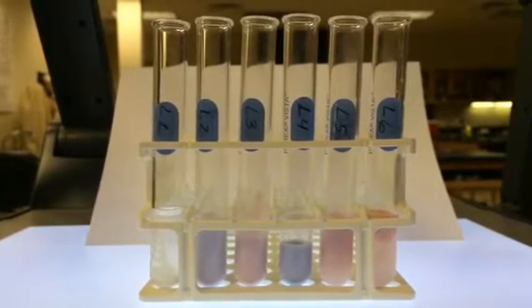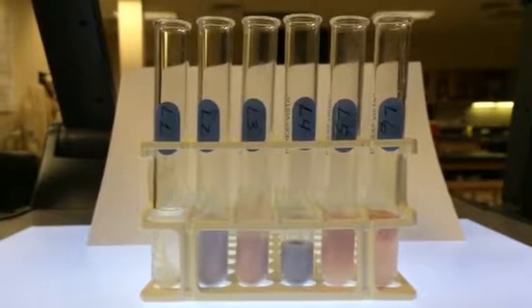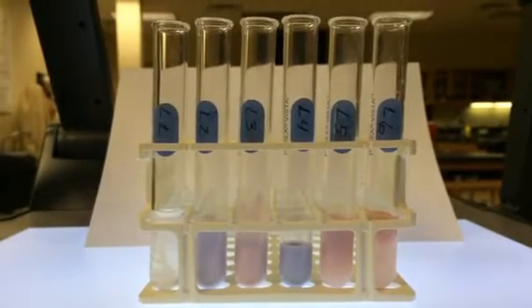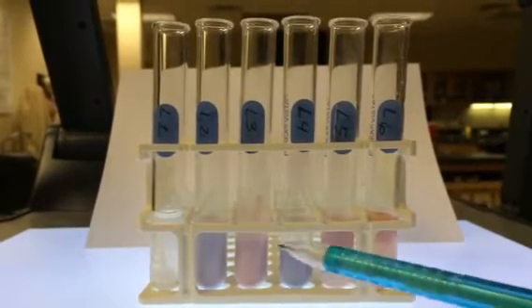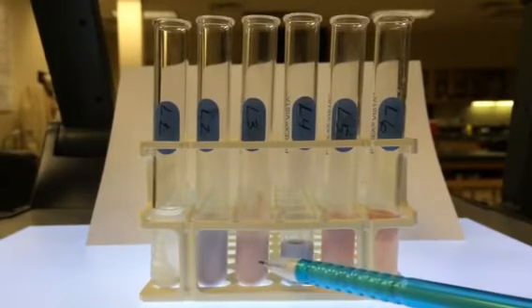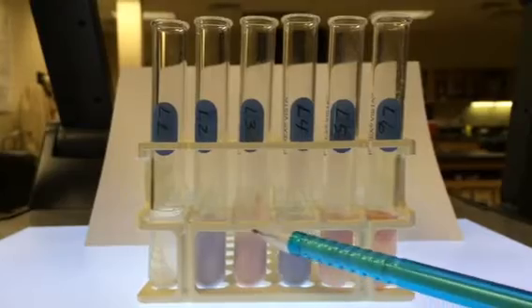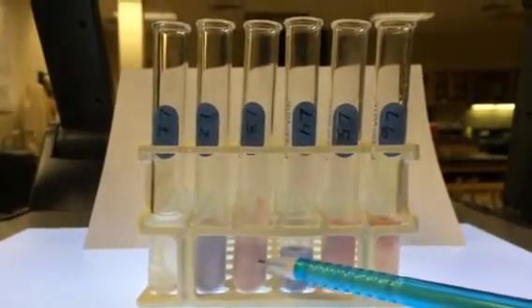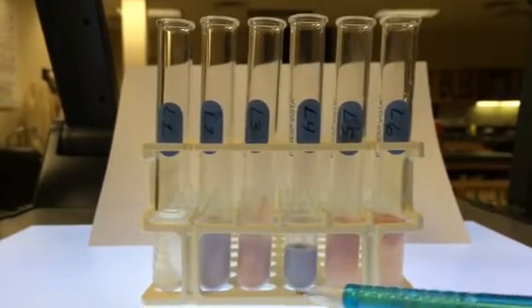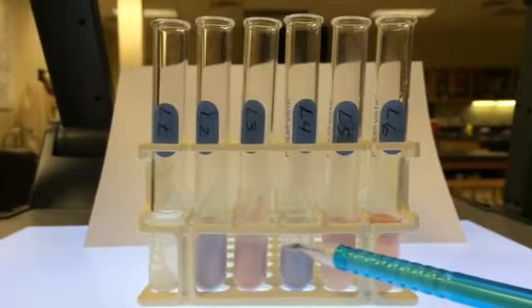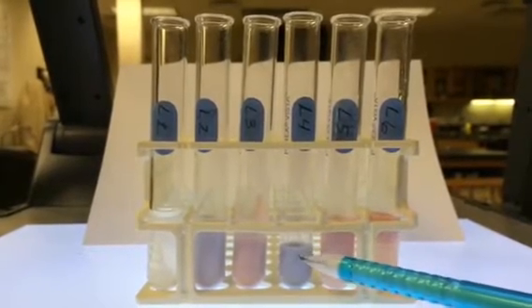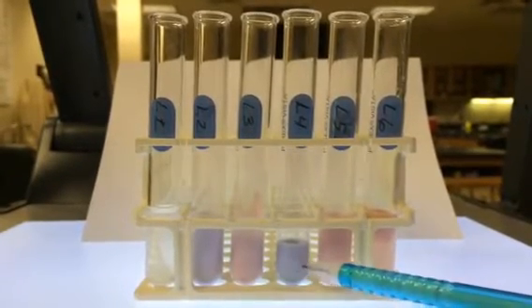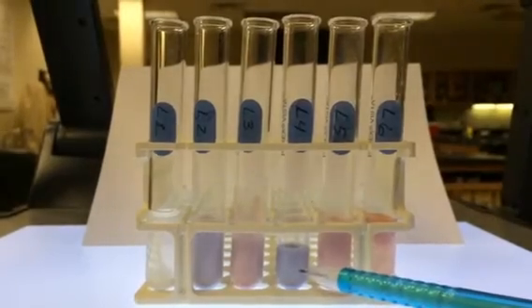So let's look first at the results that simply indicate what the litmus cream does in acidic or basic solutions. In test tube L3, you added litmus cream and a few drops of hydrochloric acid, and you can see that this tube turned pink. So that indicates acidity. In test tube L4, you had litmus cream and a few drops of sodium hydroxide. Sodium hydroxide is a strong base, and that turned the litmus cream blue. And blue litmus indicates that a solution is basic or alkaline.